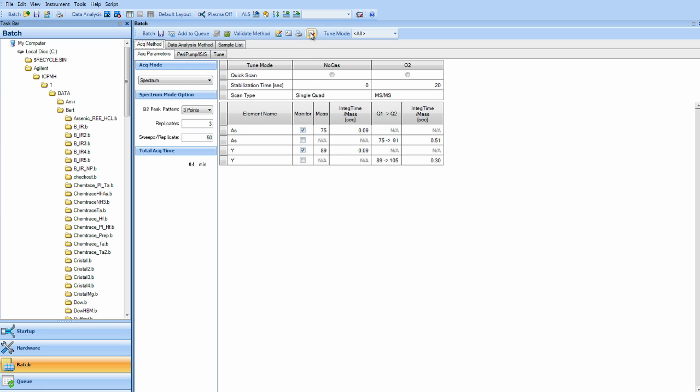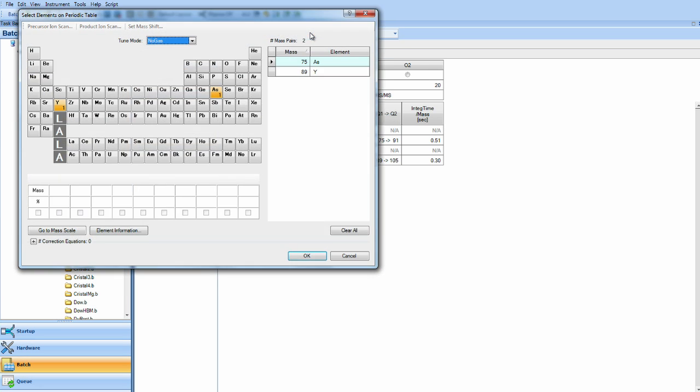To select a mass, we can just go to the periodic table here, and left click arsenic, and the default mass comes up. To remove a mass, we right click.